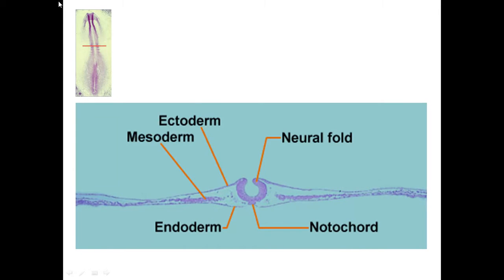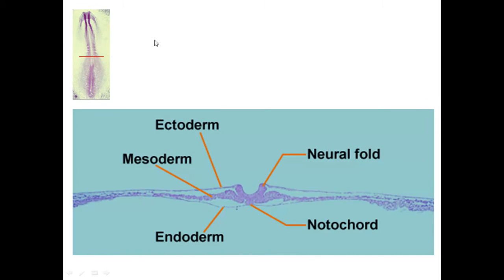Alright, so here, in the lower region, you are still seeing the same structures: the three germ layers, the neural folds, and then the notochord. Then on the posterior portions, or the cut along the posterior side of the animal, nearing the primitive streak, it's now seen as a smaller structure than before, right? You're seeing a flattened, or about to be flat, neural plate.